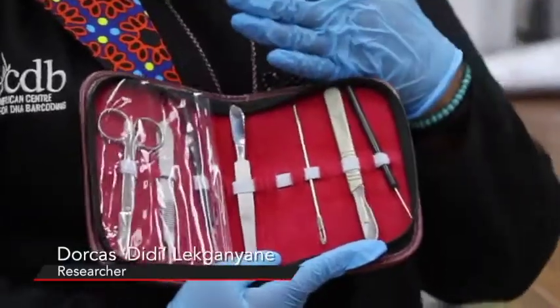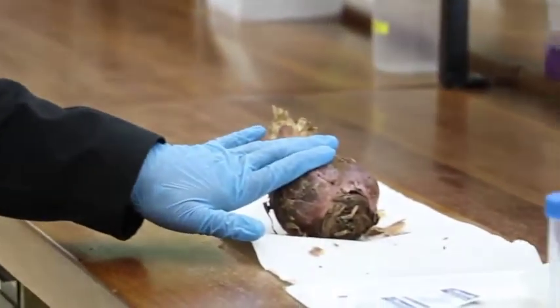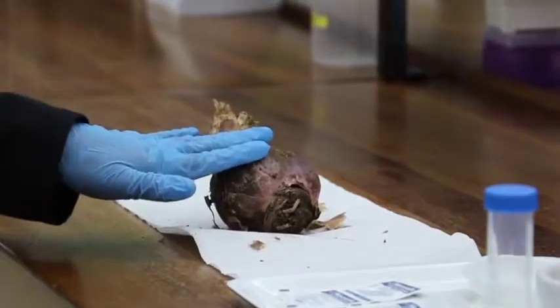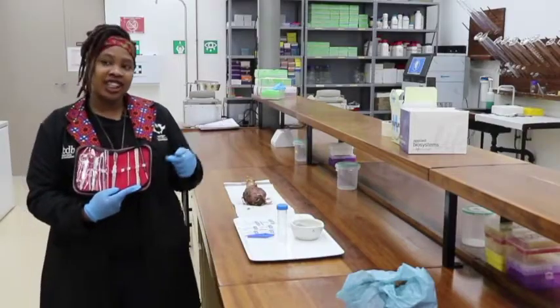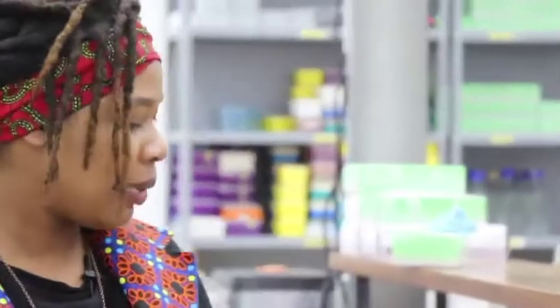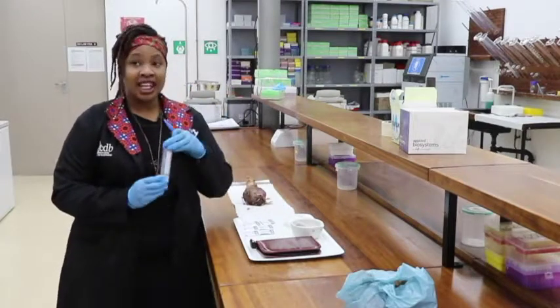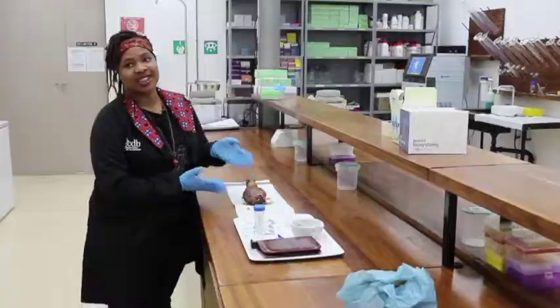This is an extraction kit which we use to take just a bit of leaf sample — probably five centimetres by five centimetres of any fleshy leaf material. Once we've done that, we will place our leaf sample using these forceps into a container. Then we go to the extraction room and start the chemical process of lysing, which means breaking down the material to open it up so the DNA can actually be extracted from the plant sample.